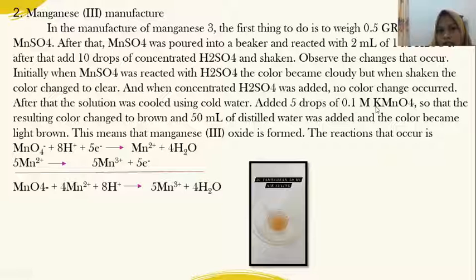In the manufacture of Mn(III), the first thing to do is to weigh 0.5 grams of MnSO4. After that, add 10 drops of concentrated H2SO4 and shake. Observe the change that occurred.